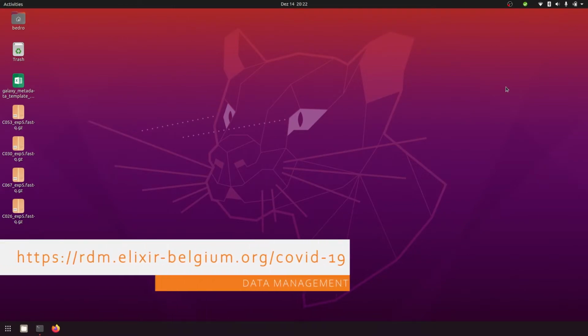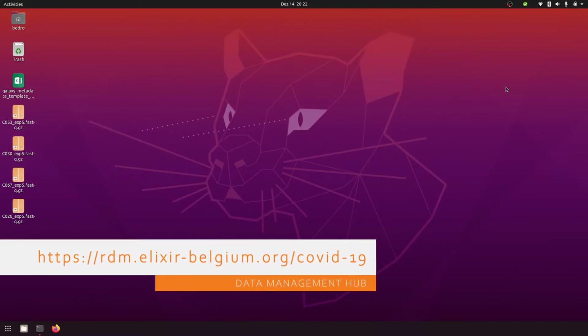All details can also be found at our website rdm.elixirbelgium.org COVID-19.